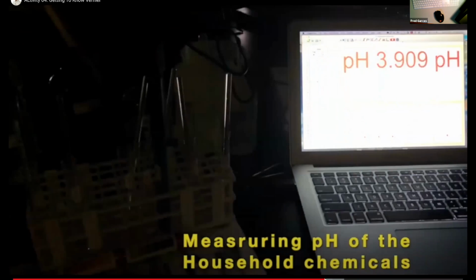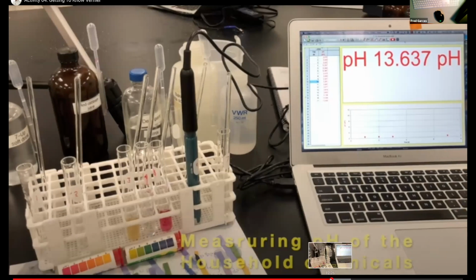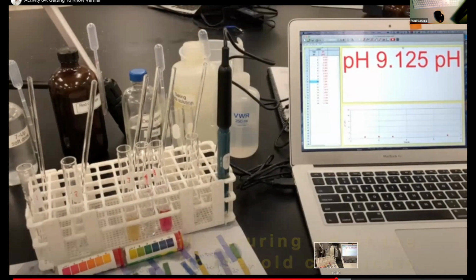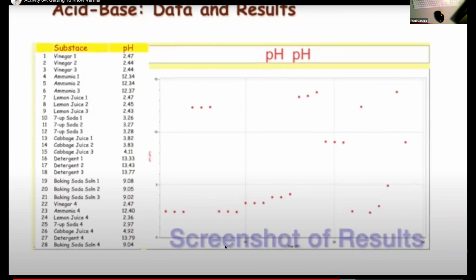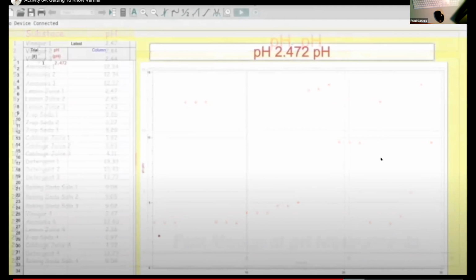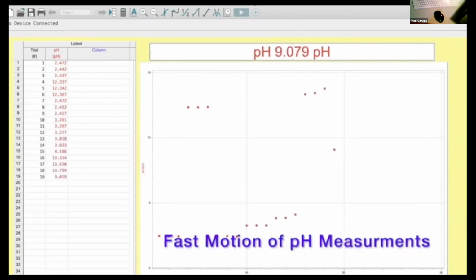So that's the pH. You can see that whereas this experiment in the lab would probably take about, remember we're doing it over 2 days, maybe 4 hours, this whole thing is done in 17 minutes. But you have a chance to go forward and backwards. Here's the pH of the different solutions. This is series 1, series 2, series 3, series 4, 5, 6, 7. These are the data sets, again doing it in triplicate.